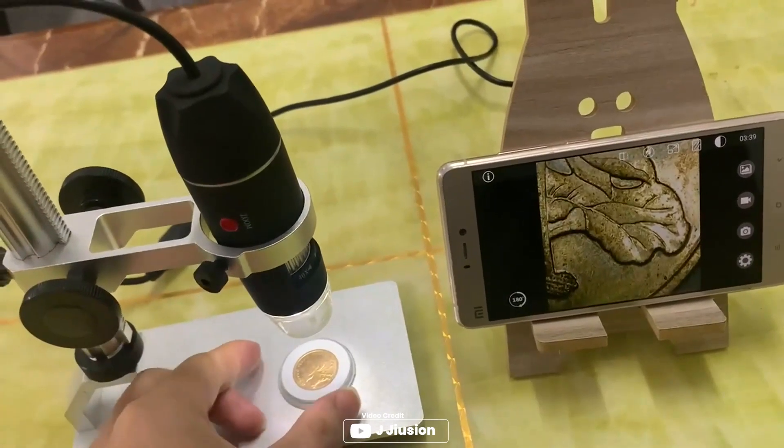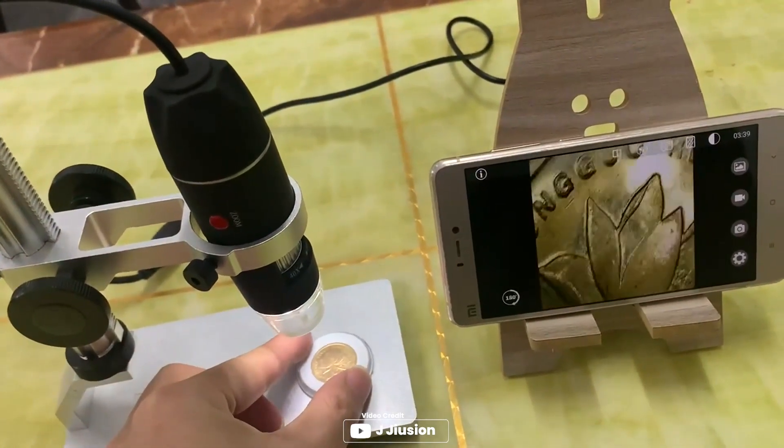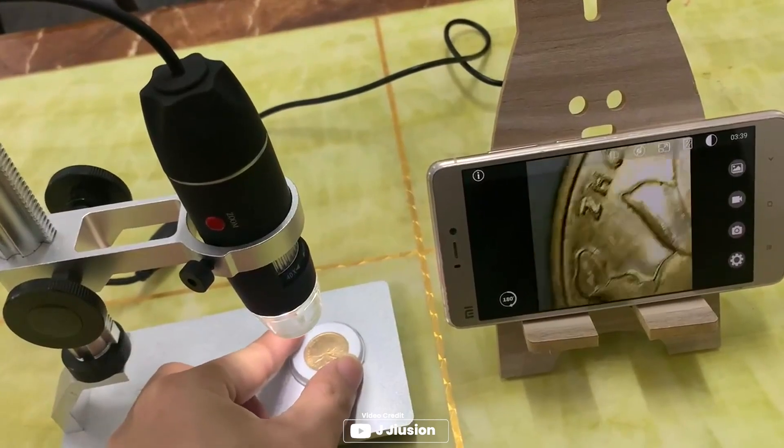The microscope has built-in 8 LED lights and 2 adjusting knobs that can change the focus and brightness. Pros: zoom features work smoothly, improved brightness control.